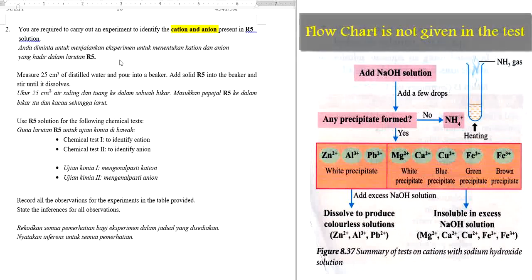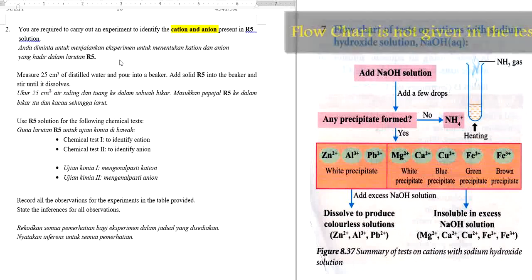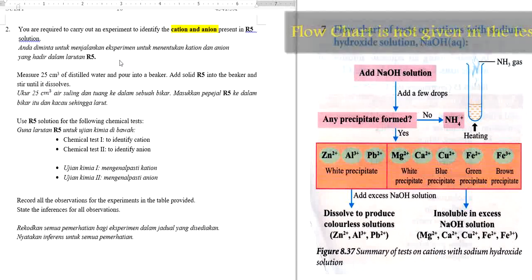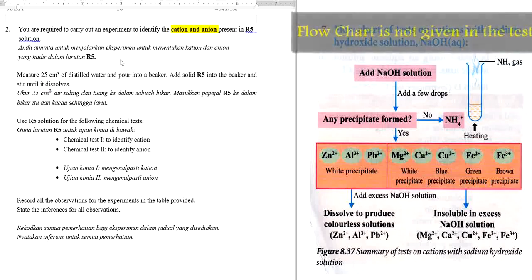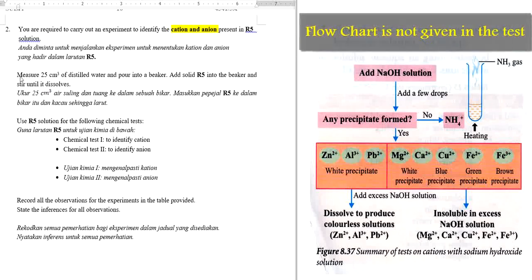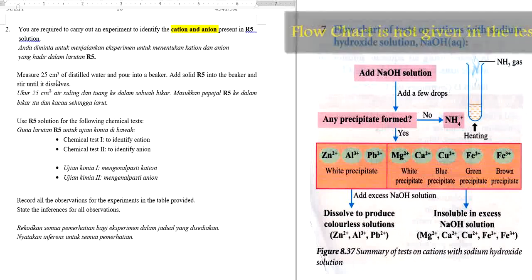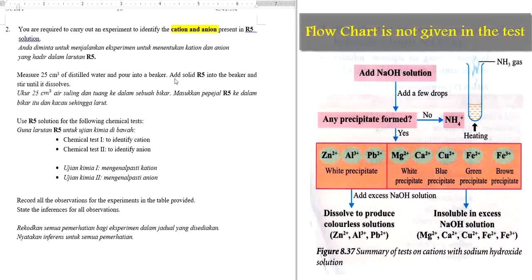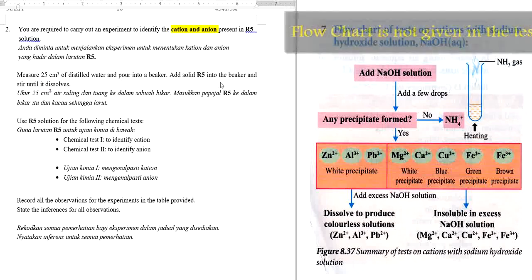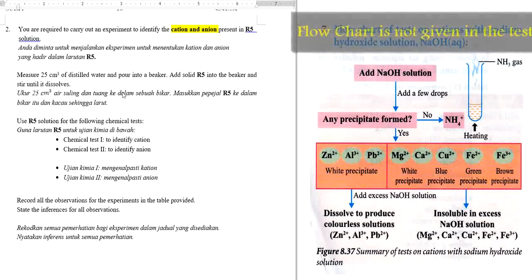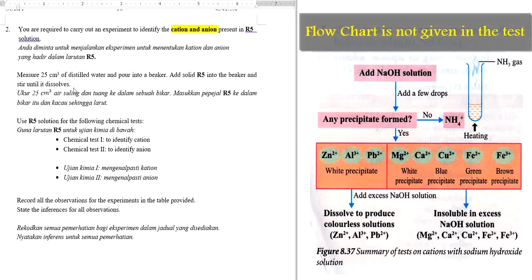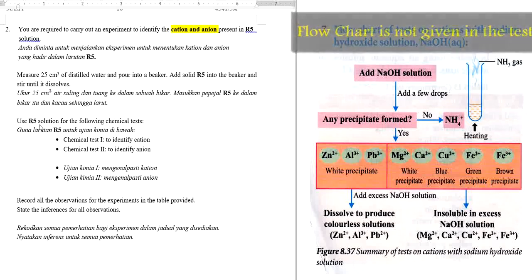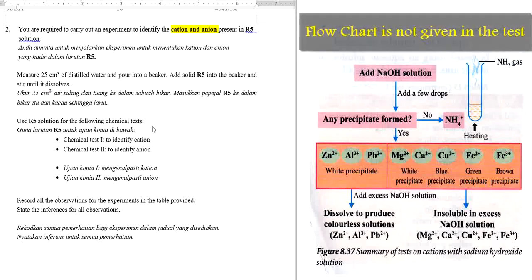R5 will be given as an unknown salt. Normally, the unknown salt will be put into a small packet. The instruction here: measure 25 cm³ of distilled water and pour into a beaker. Then add solid R5 into the beaker and stir until it is dissolved. After that, use the R5 solution for the following chemical tests.